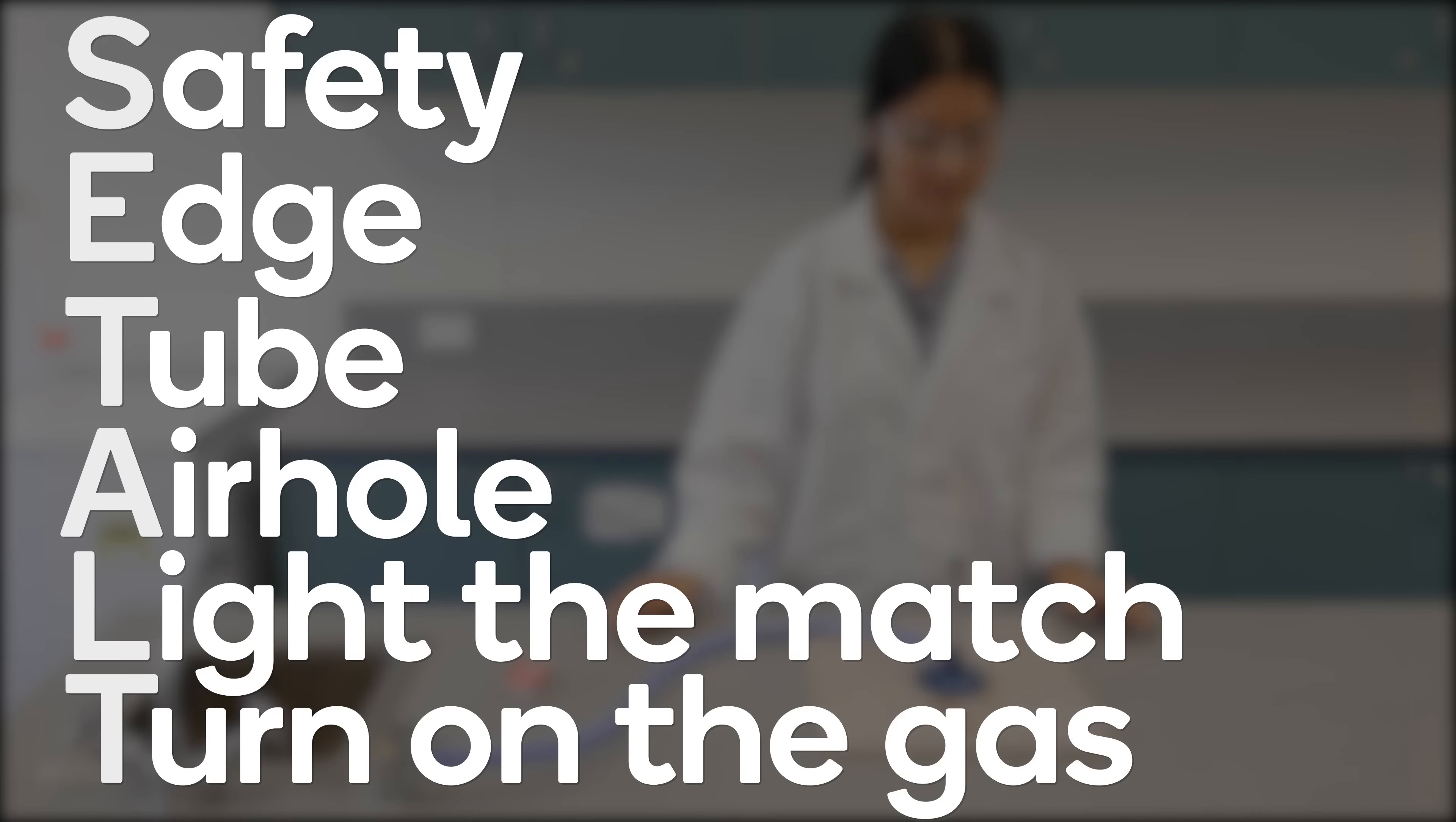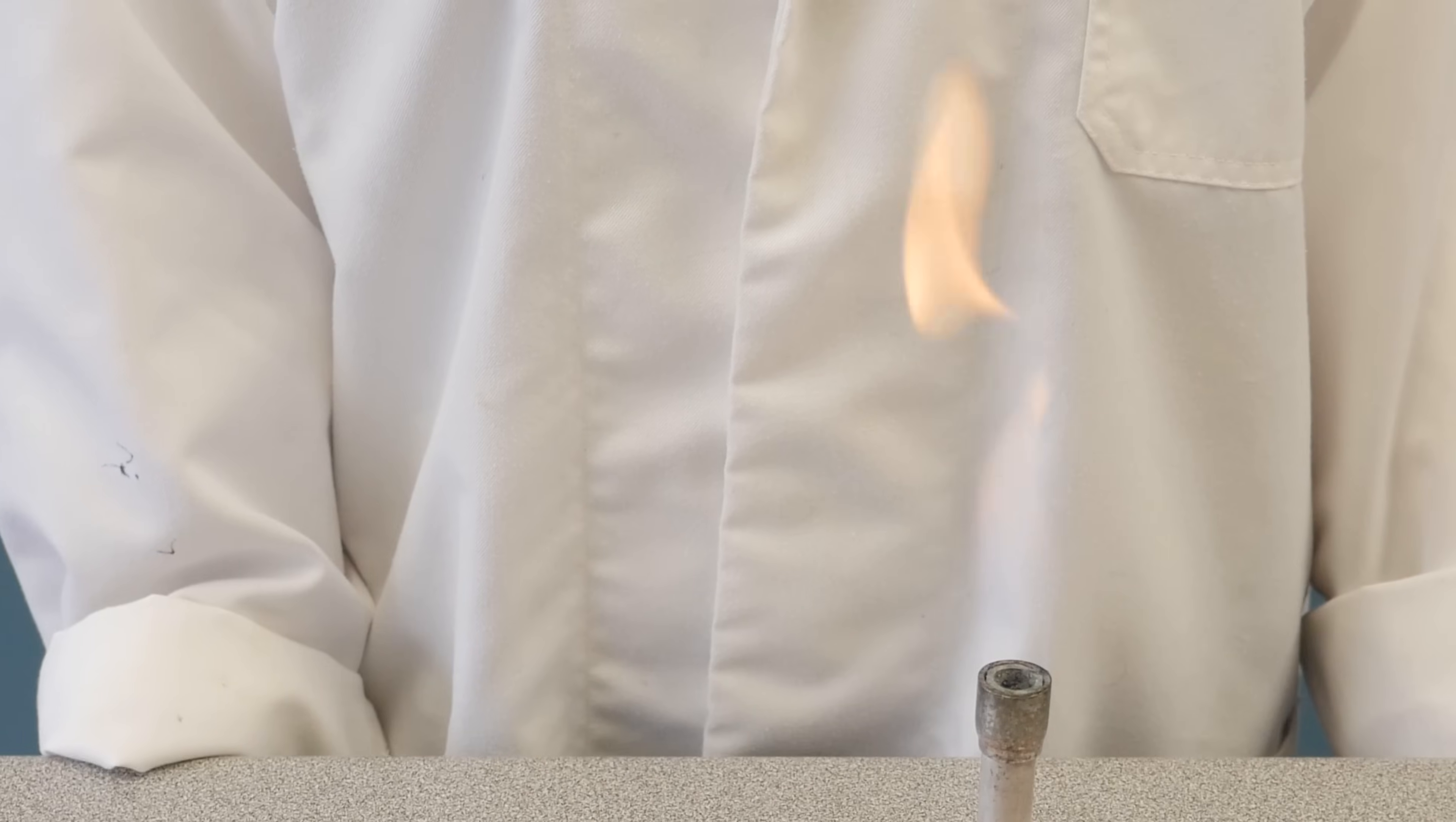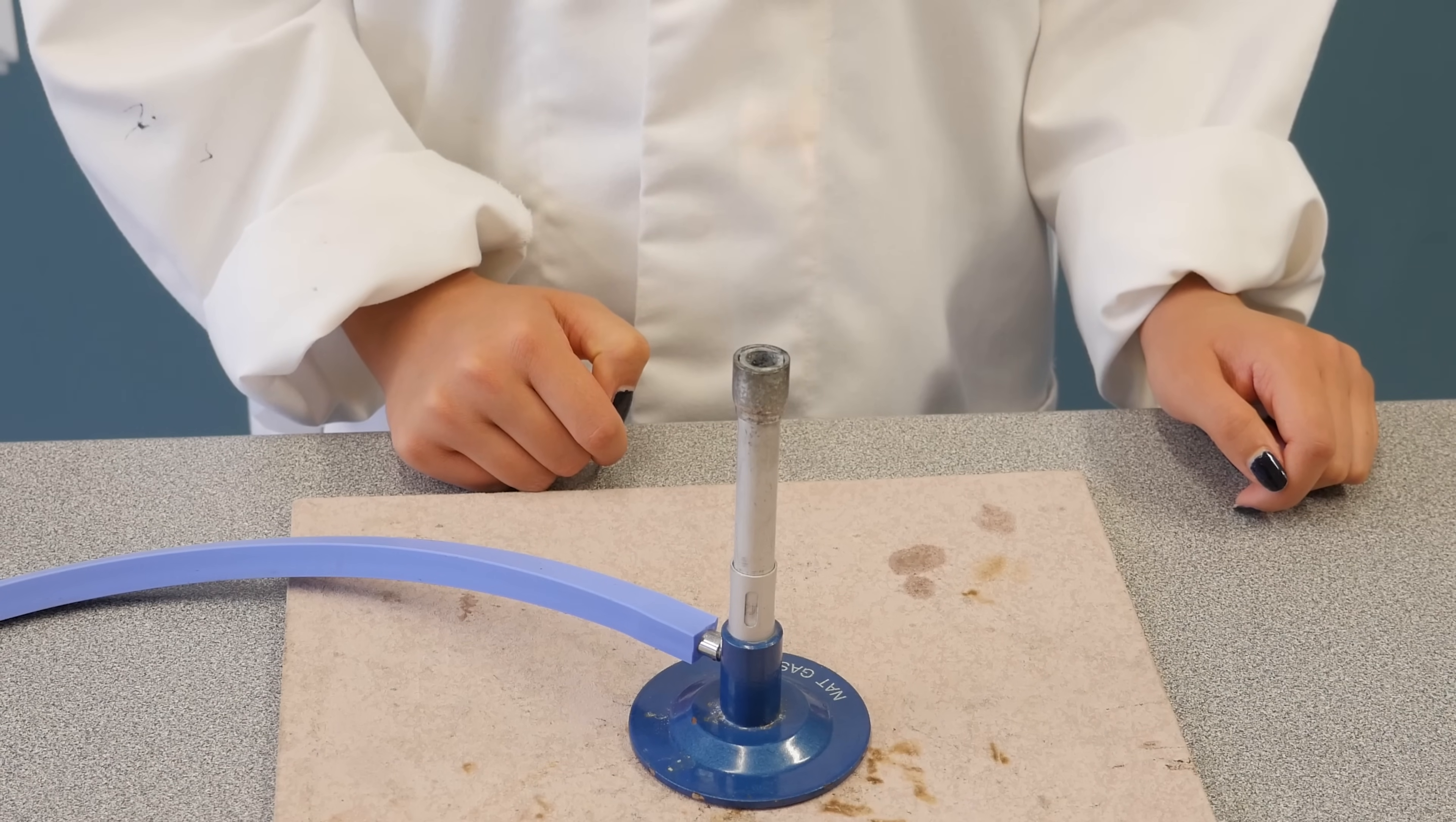You should always follow these six steps when lighting a Bunsen burner. Now you've successfully lit the Bunsen burner, you should begin with a bright yellow flame. This is called the safety flame because it's easy to see and isn't as hot as the full flame.